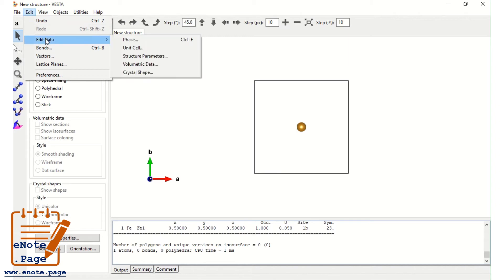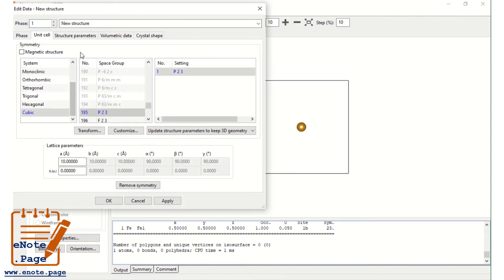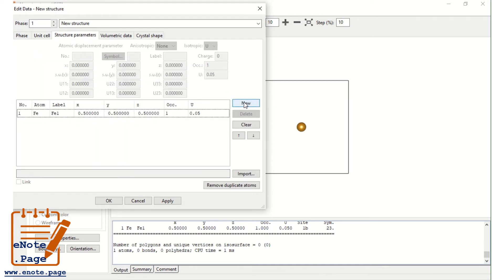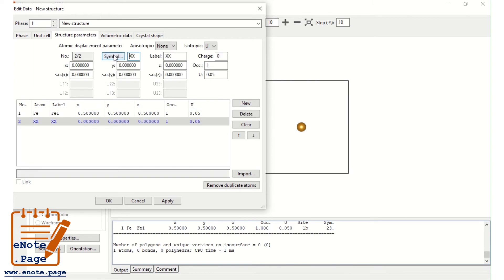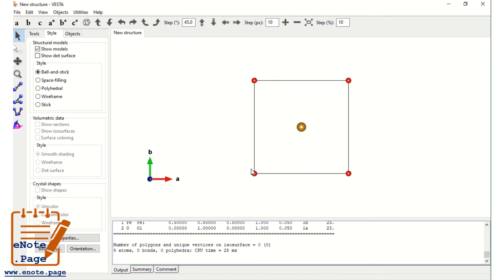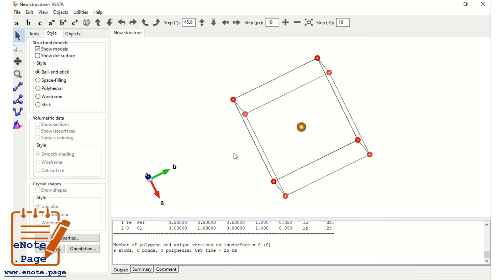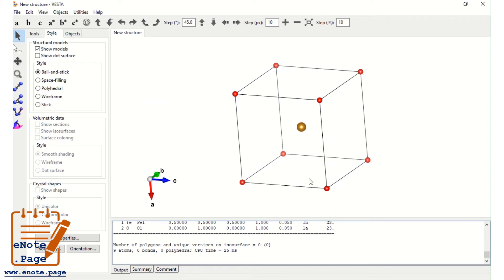Now let us place one more atom. Go to Edit Data > Unit Cell > Structure Parameters and click New. Let us take oxygen. Label it as oxygen atom 1. Instead of fractional coordinates 0.5, here I am putting y as 1 and x as 0. So from the origin, x = 0, y = 1 — that is full, that is 10 angstrom — and z = 0. Now apply. This is the basic structure, and the oxygen atoms are placed in the corners.